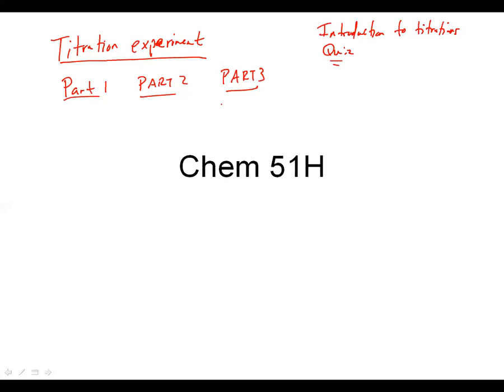So part one of the experiment is really, fear not, but for now we will do the entire experiment. These are three different parts of the experiment. We're going to talk about each of the parts and give you an idea as to what you should be doing, what you should be looking for in terms of calculations that you might come across. So let's first do part A, or part one.